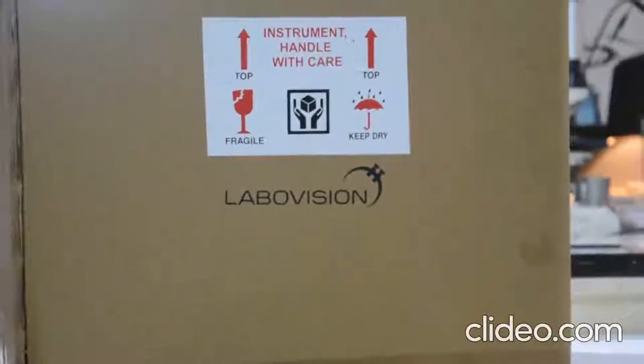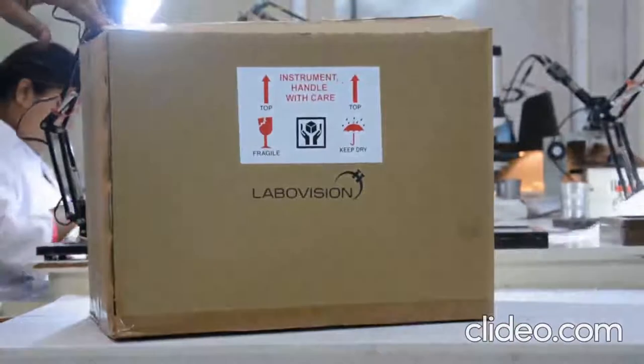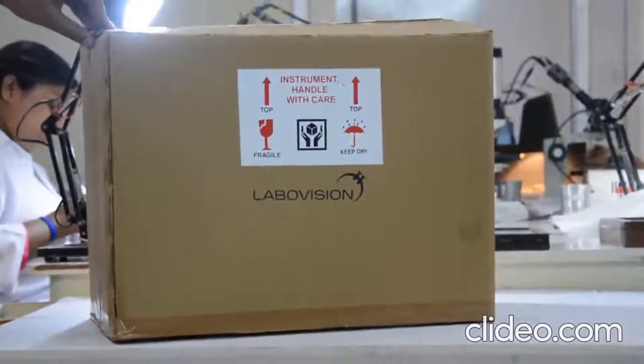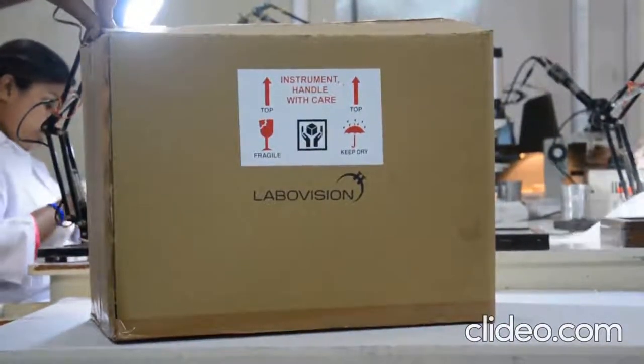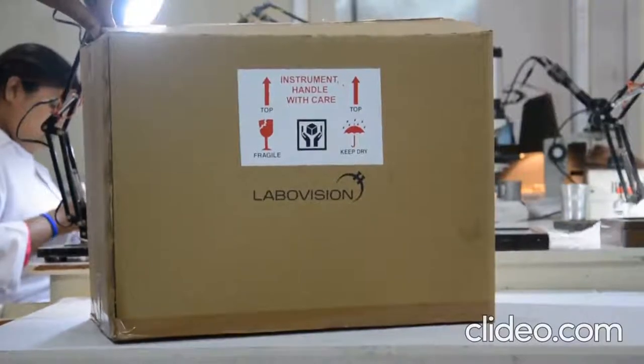Hello everybody. Today we will show you the unboxing of Labovision Visual Microscopy Solution Model DG Sense View Star.